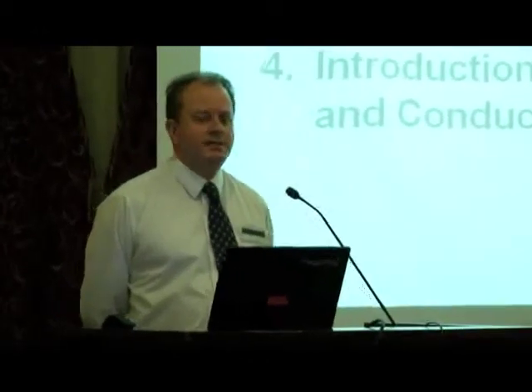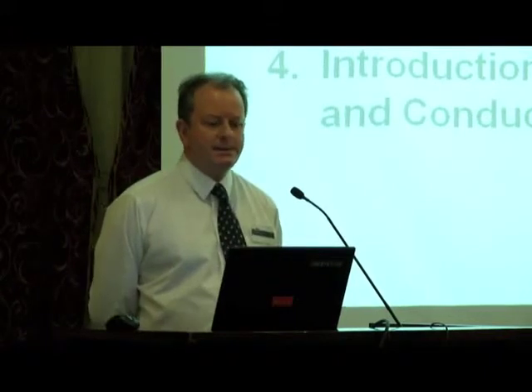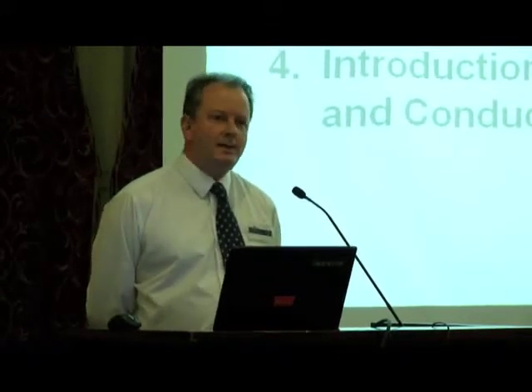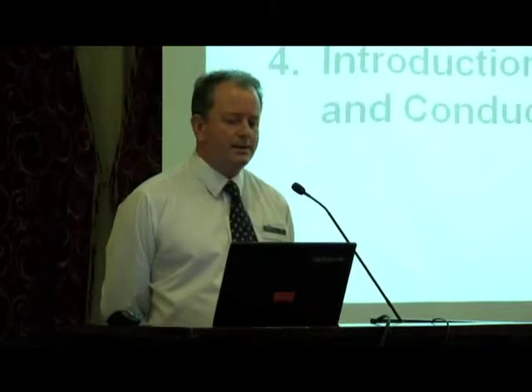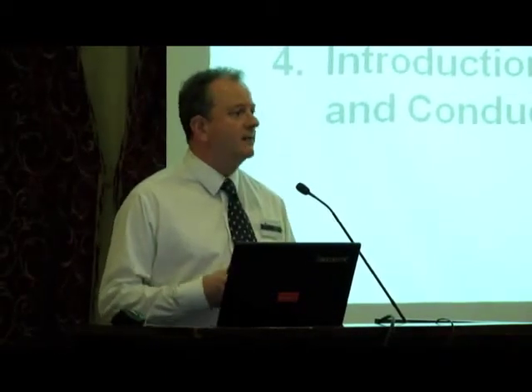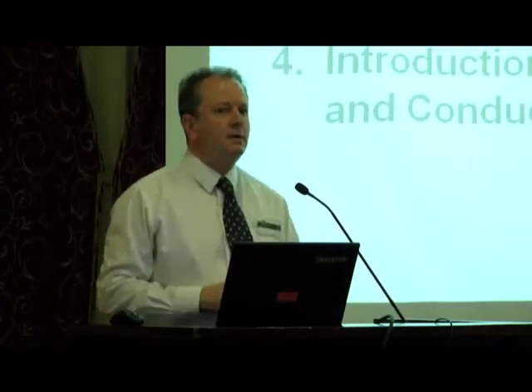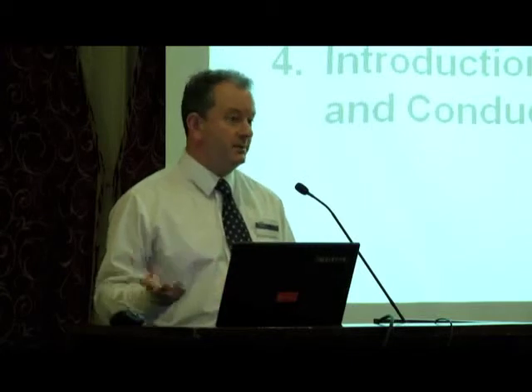The content of my presentation will cover conductivity, TOC analysis, a bit about validating a TOC analyzer, and then I will talk about one of the instruments we have brought with us here today, which is on the table over here, the PAT 700 TOC analyzer.